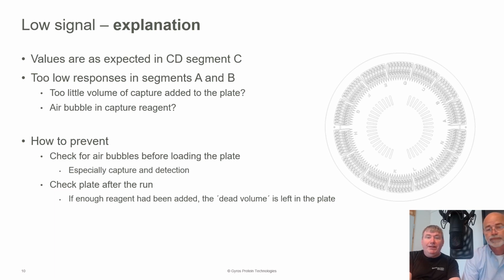Yeah. No, we've had a great example when somebody was doing this with 100% matrix and overspinning the plate, and that actually made things worse because it, as you say, pelleted everything into the bottom of the well, and then the instrument goes to the bottom of the well to suck up the samples. So that's the important part.